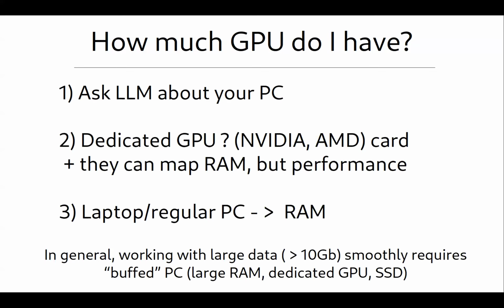One is when you have a dedicated, powerful GPU, like NVIDIA or AMD Radeon or whatever people use for gaming. Usually each card, when you buy it, says it has 16 gigabytes of GPU memory or that much. Usually this value still can be expanded. You can put a higher value, because when these cards run out of this really fast GPU memory, they start to use RAM, but then things are much slower. So that's a bit of a trade-off.